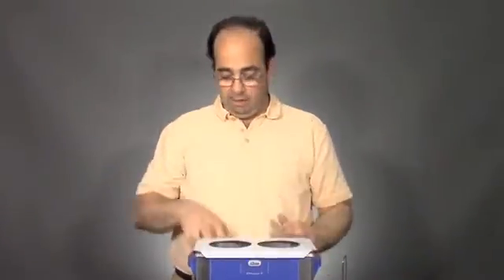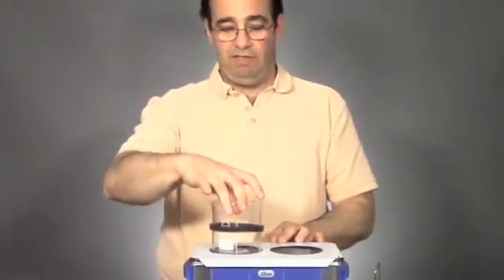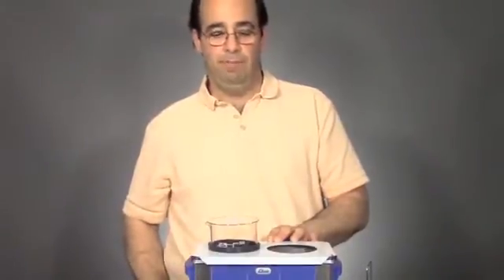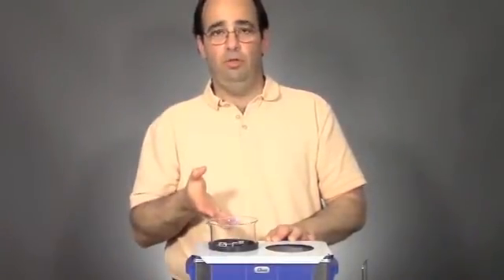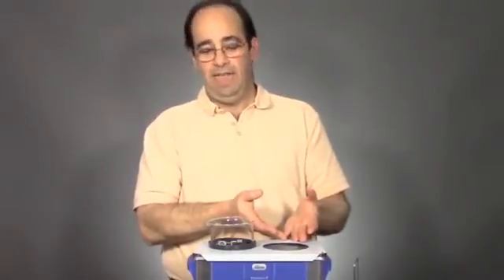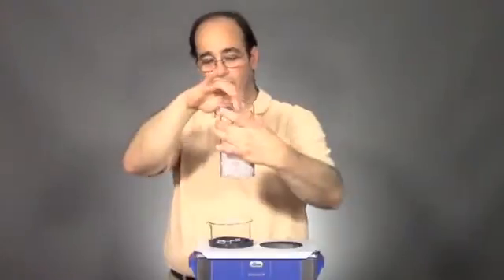The beaker cover fits right over the tank. You get a beaker with it, you just slide the rubber ring on it, and the beaker fits nicely into the hole and sits there suspended in the liquid. This is great because you can use a different liquid here as opposed to what you have in the tank. The great thing about the immersion basket is that it's designed to fit right in.